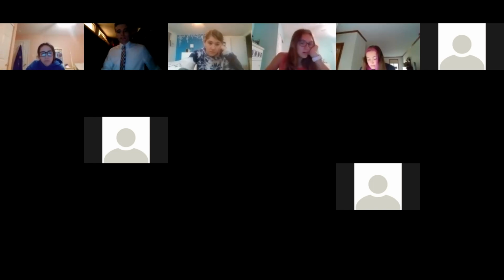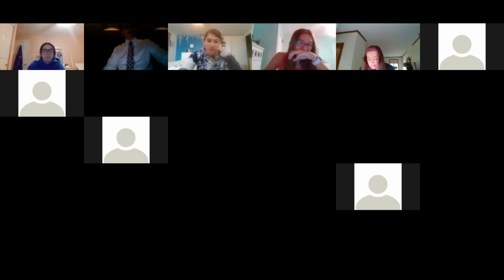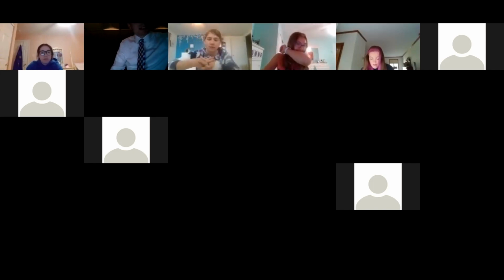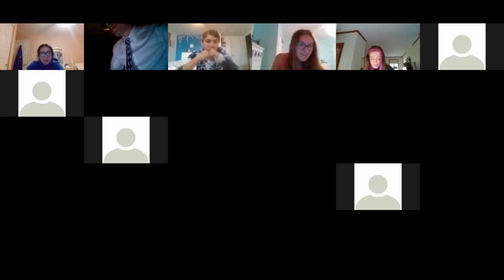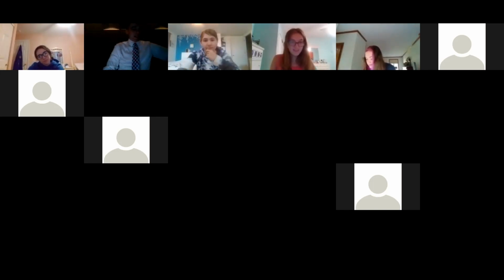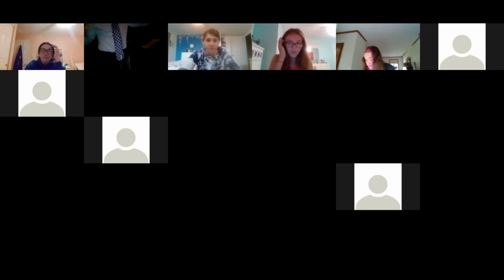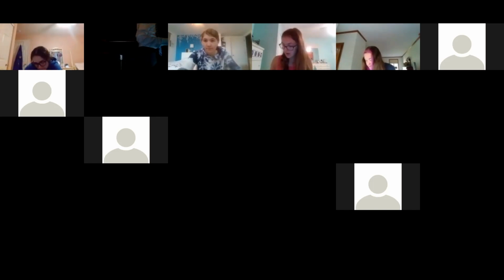Okay, do I look like a ghost just walking around in the dark? No. Later, this makes me sad, Jerry. I thought I was looking like a ghost. Jerry, whose real name is Oscar, trying to fool me, trying to pull a quick one on Mr. C. Okay, let's see. Pull this thing out. Oh, that is gross feeling. Ew. Okay.